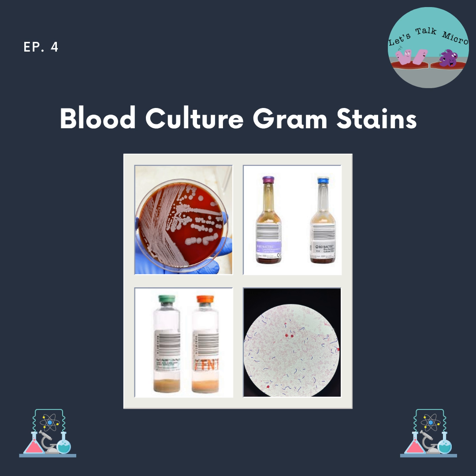Another difference between blood culture gram stains and regular gram stains is that on the regular gram stain, if you don't see anything, you report it as no organism seen. You do not do this for your blood cultures. If you don't see anything, you document it internally, meaning the part of your report in the computer system that only the lab sees.